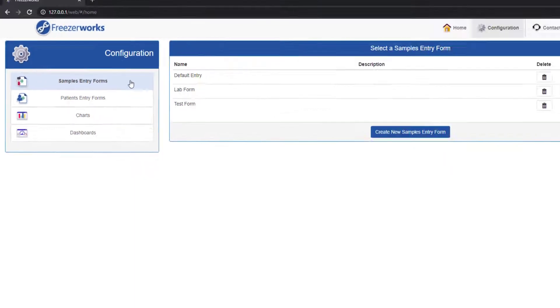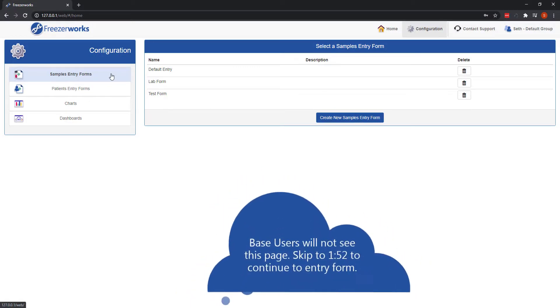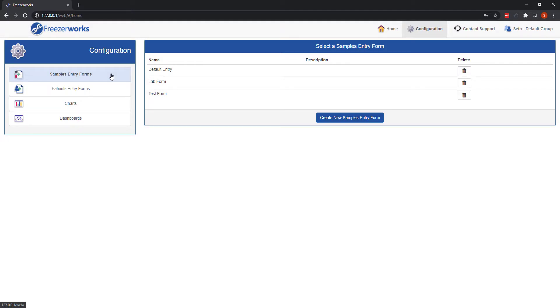Now, if you are in FreezeWorks Base Edition, your screen will look very different at this point, as base is limited to only one samples entry form. That being the case, you will immediately see your single entry form's configuration, but we'll get there shortly.